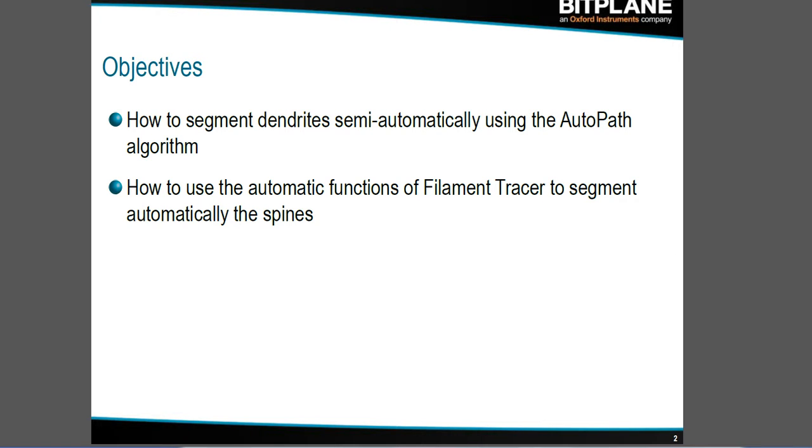Our objectives are to learn how to segment dendrites using the AutoPath algorithm and how to use the automatic functions of FilamentTracer to automatically segment the spines of such dendrites.